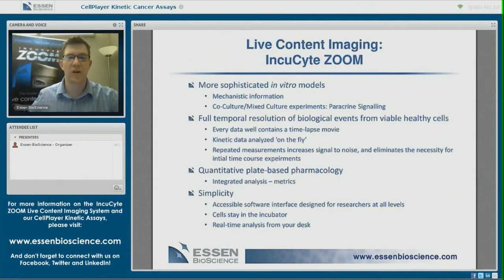webinars. And so at this point, I'd like to conclude just by summarizing live content imaging within the IncuCyte Zoom system. We believe that with the live content imaging approach using IncuCyte Zoom can provide more sophisticated in vitro models, that you can gain increased mechanistic information, and that these co-culture or mixed culture experiments can begin to interrogate different signaling pathways, including crosstalk between two different cell types in a paracrine signaling type fashion.